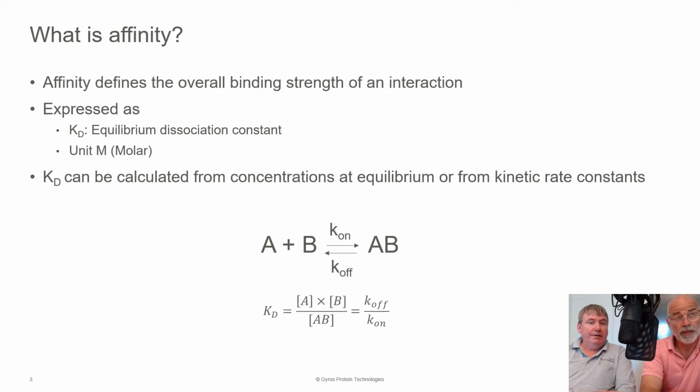Yeah, the thing about the Gyrolab system is that, remember, the equilibrium happens offline. It's a pre-incubation on a plate, and that gives you the flexibility to let that incubation go as long as is required to get to equilibrium, because that's when you're going to make your most accurate determination of KD.